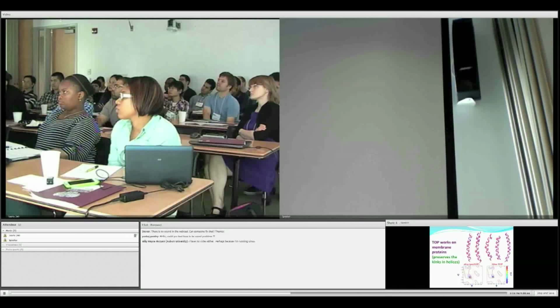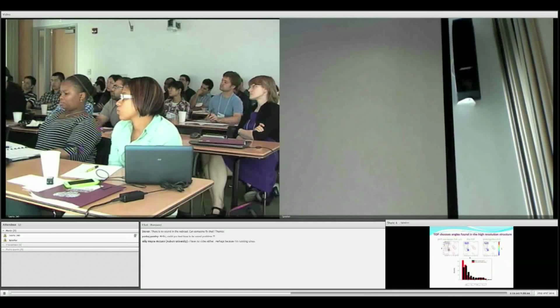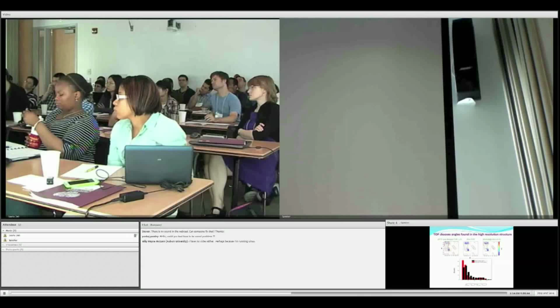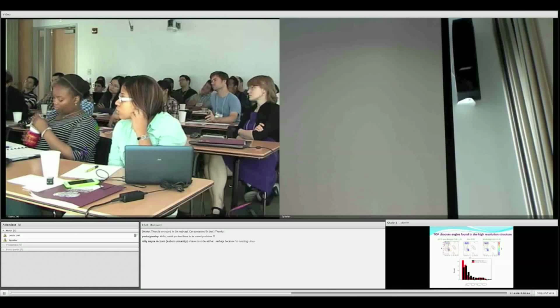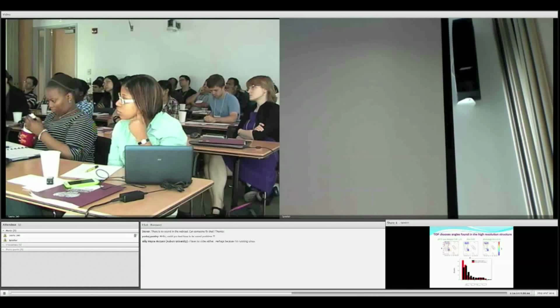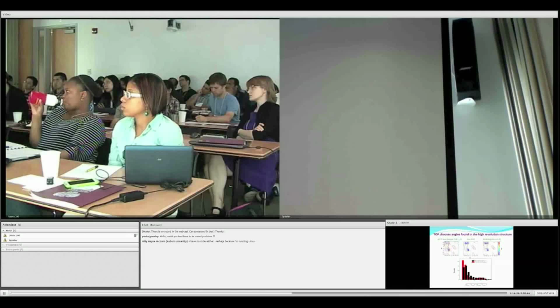Just a quick note: if you are familiar with ion channels, in the channels the helices have kinks that are important, for example, for gating. One question that came back to us is: if you improve the secondary structure and the backbones, what happens to the membrane helices that are important? Would you preserve the kinks or not? You can see that these are the helices of the cytochrome b6f complex. This is before and this is after. We pretty much improved them, but we also kept the kinks. This is the overlay of the before and after.